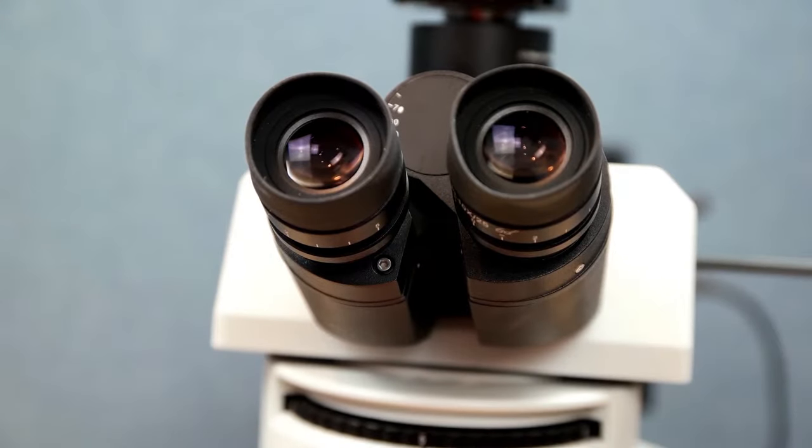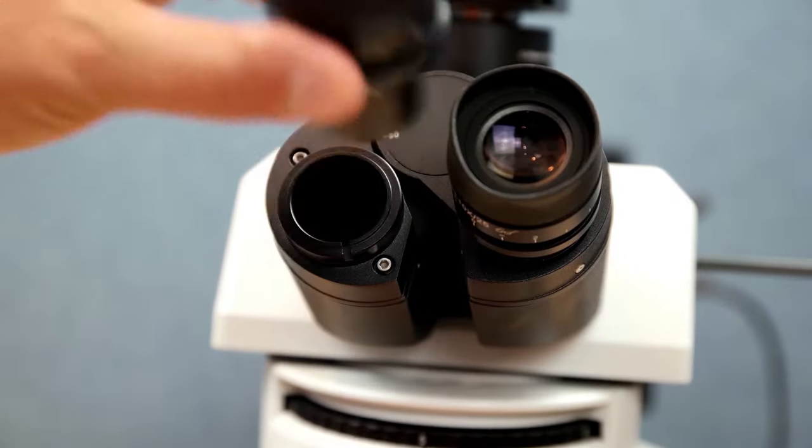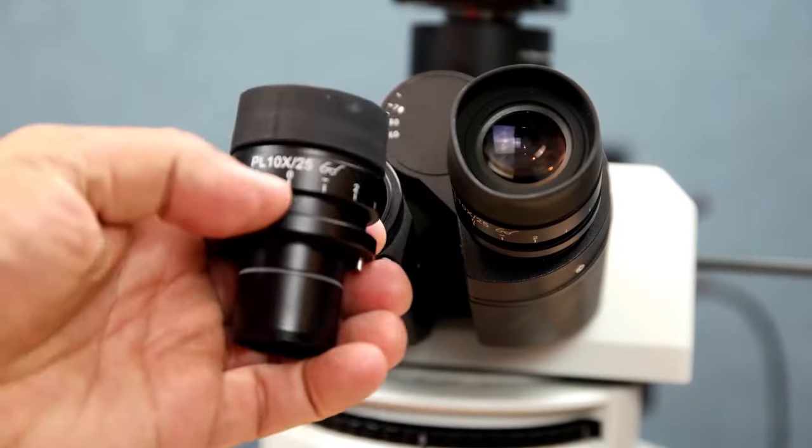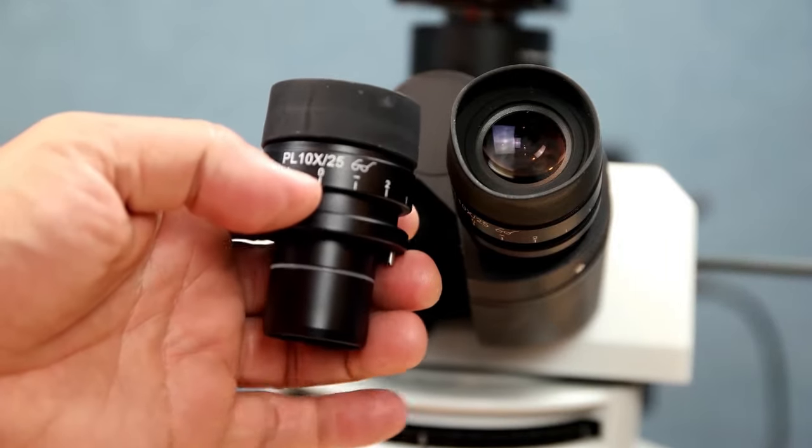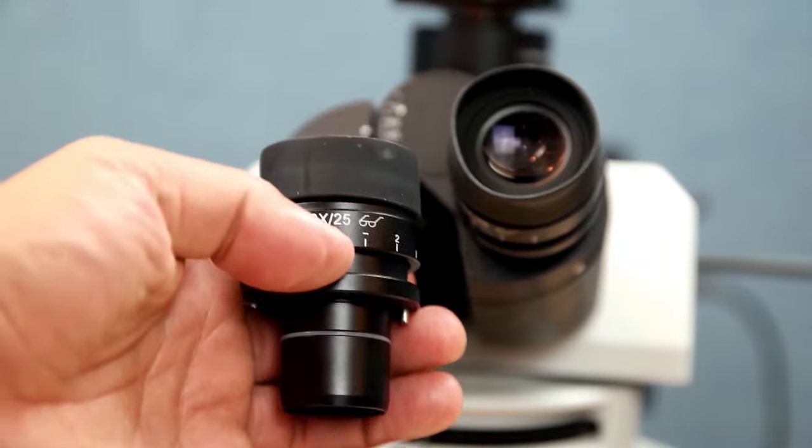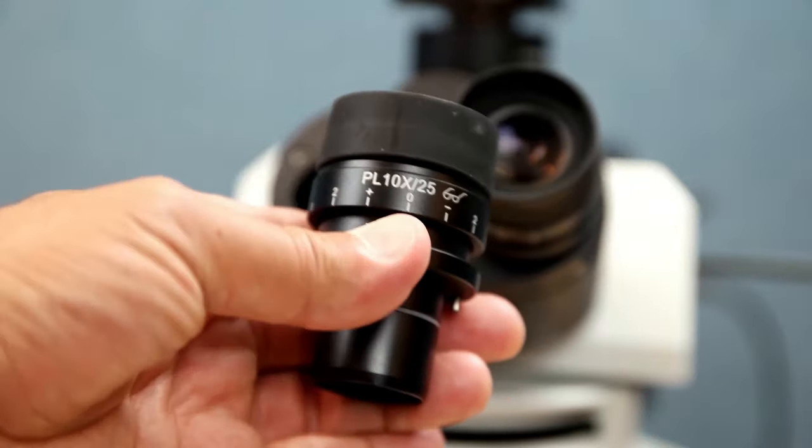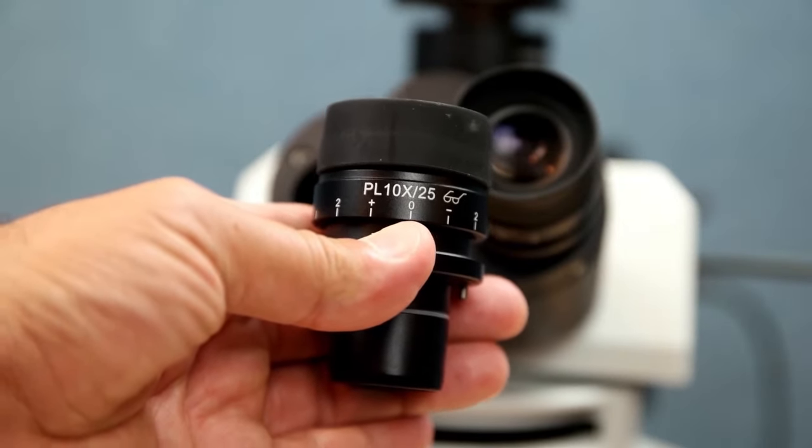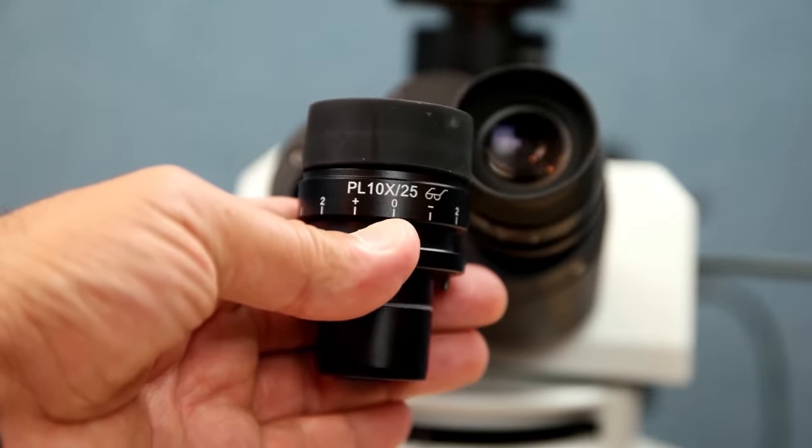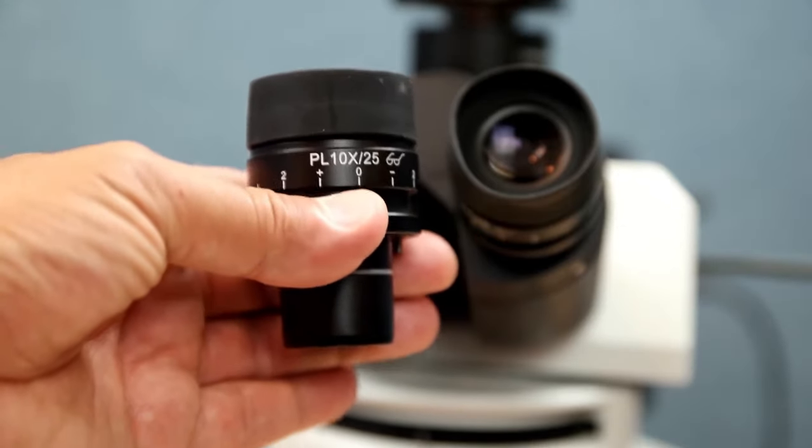One of the beauties of this microscope is its very large field of view seen by the eyepieces. By default you will get 10x magnification eyepieces which have a field number of 25mm. You can also choose 26.5mm field of view eyepieces as an option.